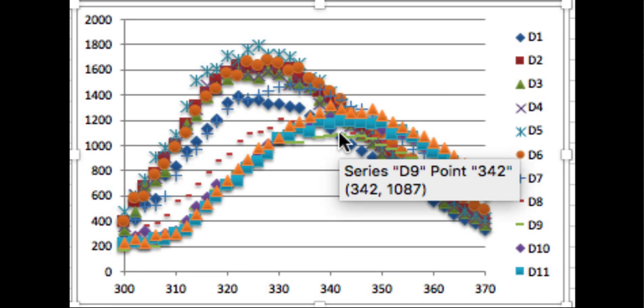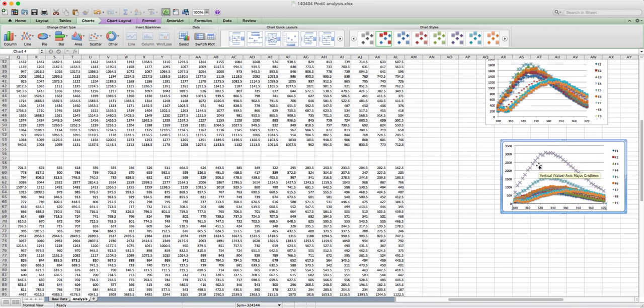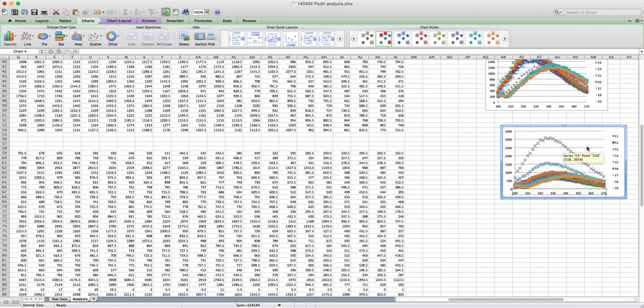So this data looks good. Let me quickly plot the third replicate. Here you can see something a little bit strange happened, where there's this huge peak. Again, remember that the height of that peak really just corresponds to the amount of protein you have. So it looks like there was some sort of pipetting error where somehow protein got added multiple times to this well, and that's why you have this huge peak here.